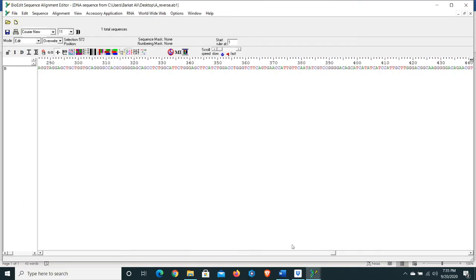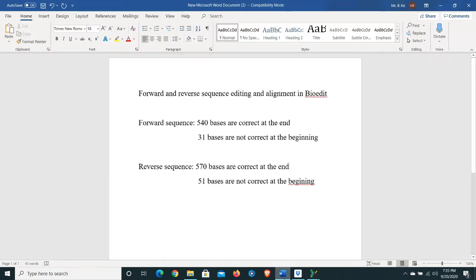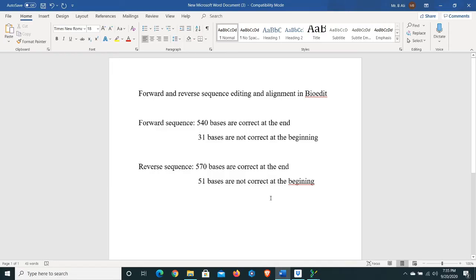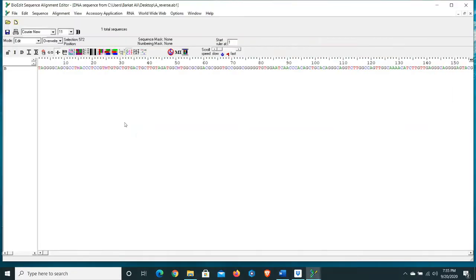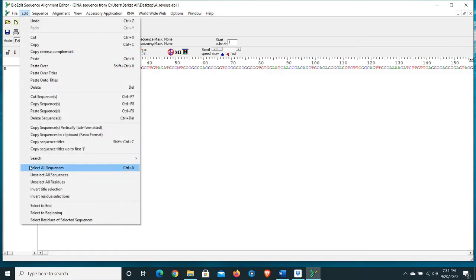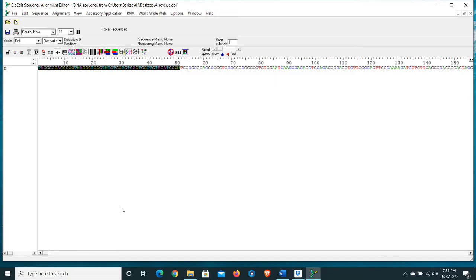Go to Edit, select 'Select to End', and press Delete. Come back to the beginning of the sequence. Check your record — 51 bases are not correct at the beginning. Mark position 51, go to Edit again, select 'Select to Beginning', and press Delete. Now we have made changes in our forward and reverse sequences — we have deleted the ambiguous and contaminated data.